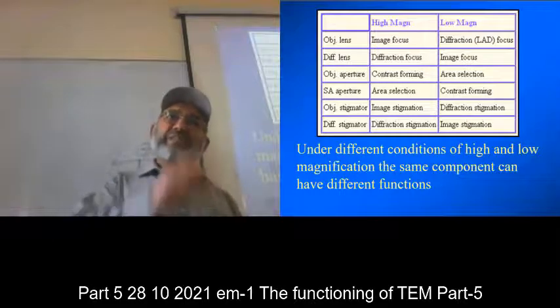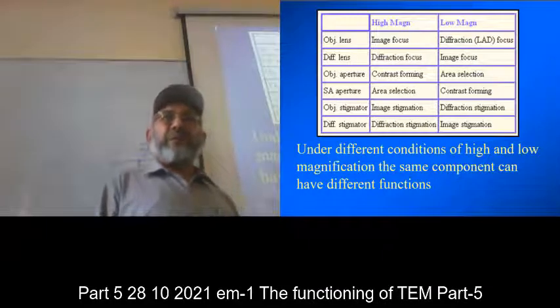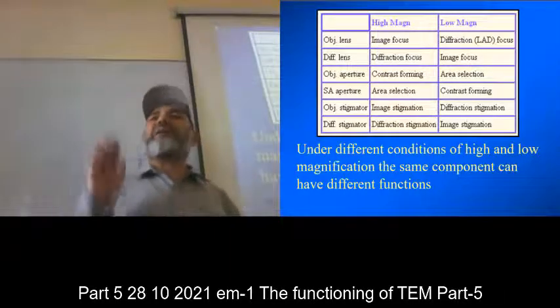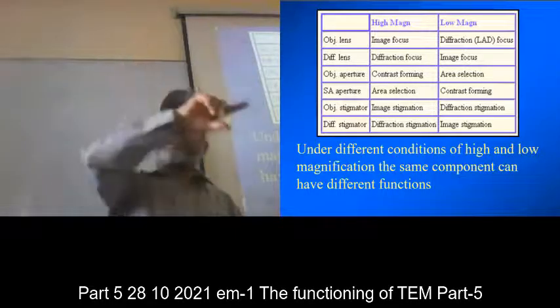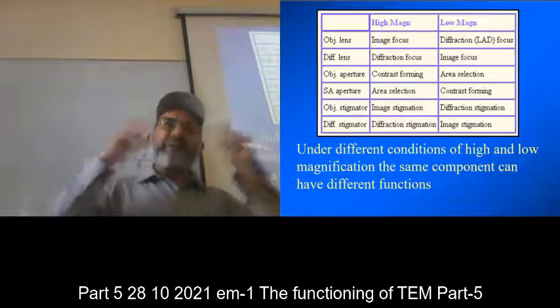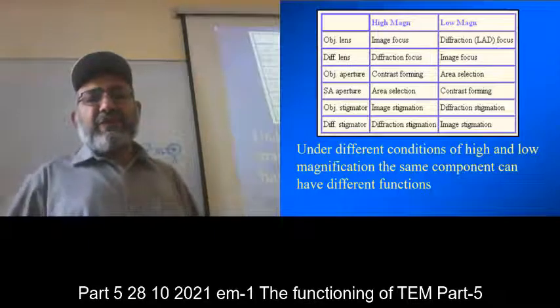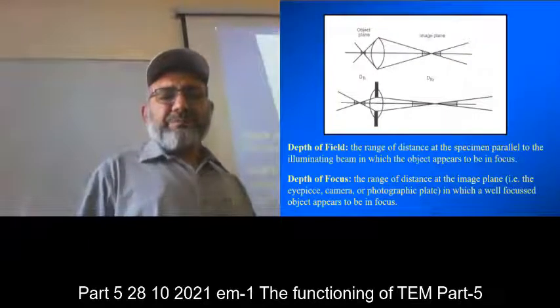If astigmatism is there, for those whose eyesight is impaired, when your eyesight is not perfect, remove your glasses and look at the moon, it will appear astigmatic, right? It will have some circles or edges which are not actually coming from there, but they are coming because of the astigmatism of your eye lenses. And diffraction astigmatism is also the same thing. The spots will appear blurred.